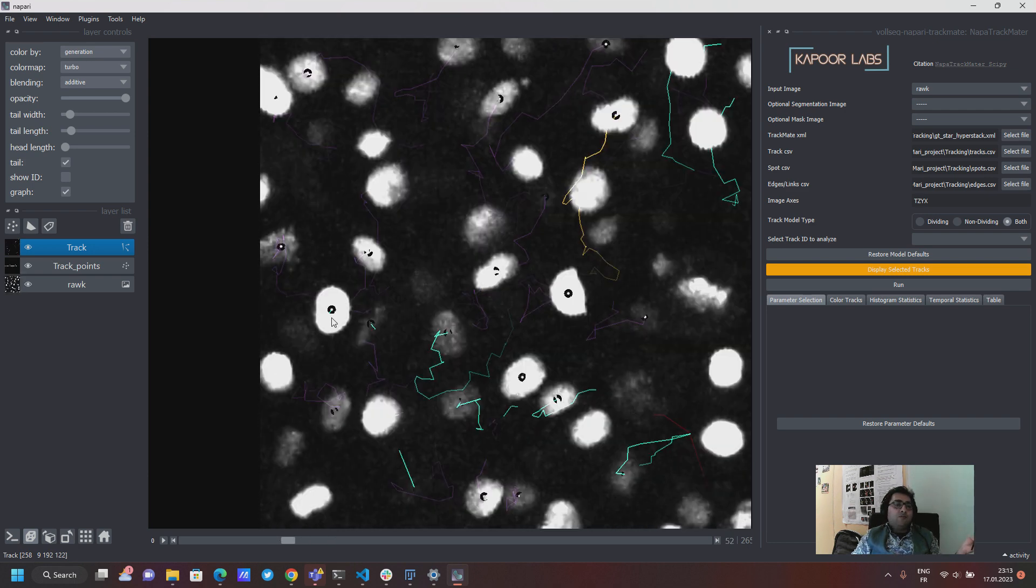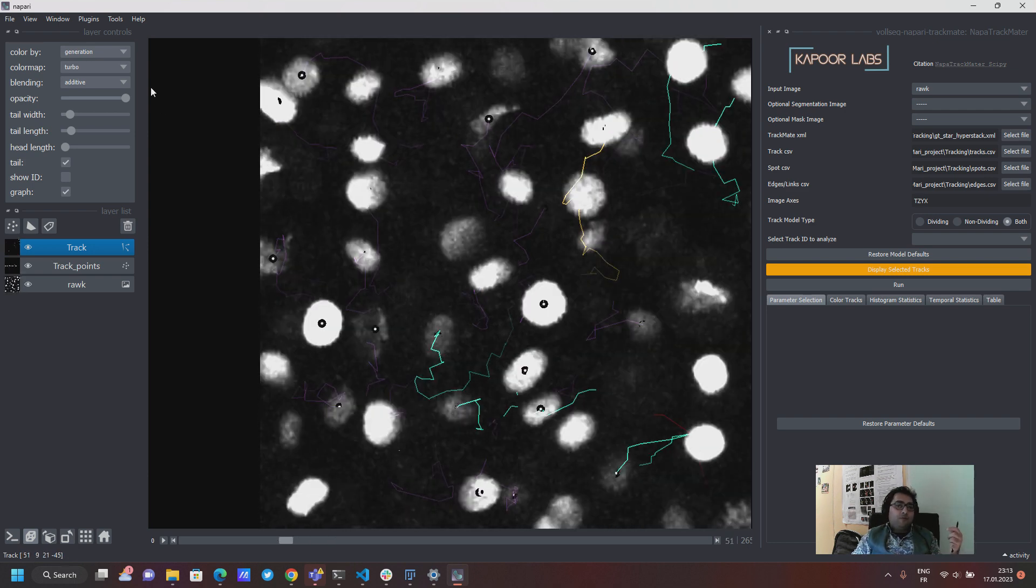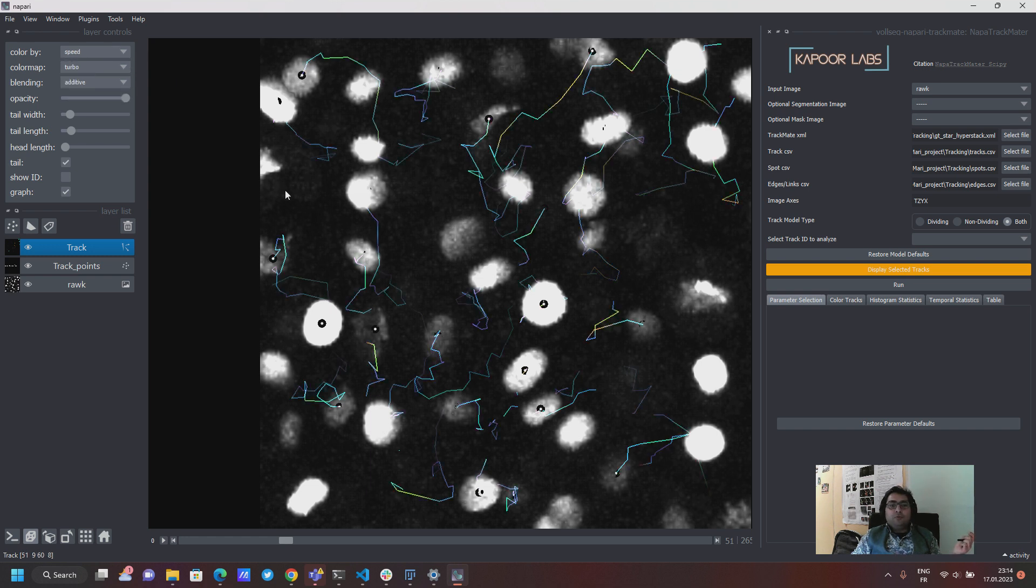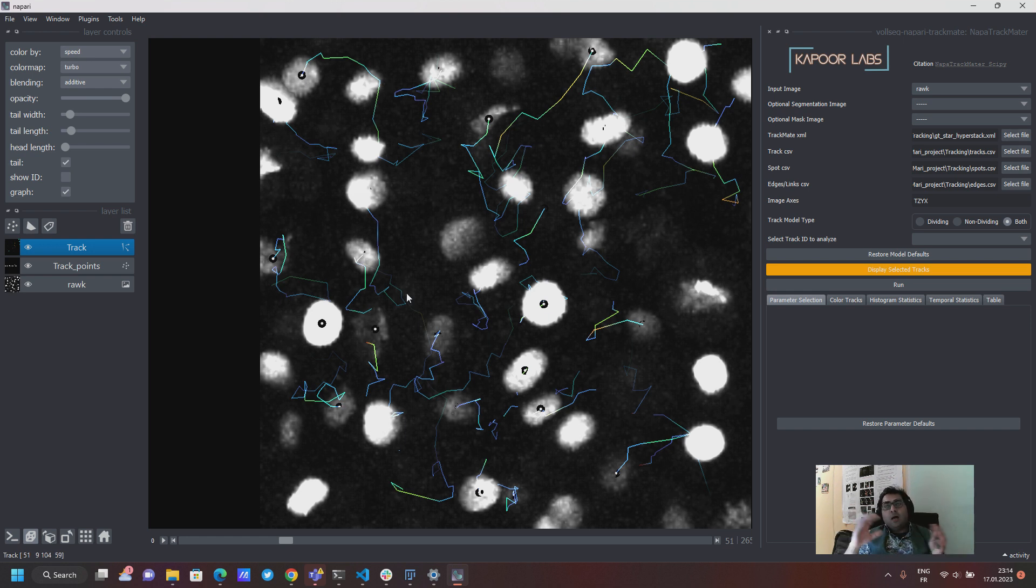So this is a kind of cool way of looking at your experiments and then using these different attributes to just color the tracks with those attributes and say okay I can visually see how the global picture looks like for my particular tracks.